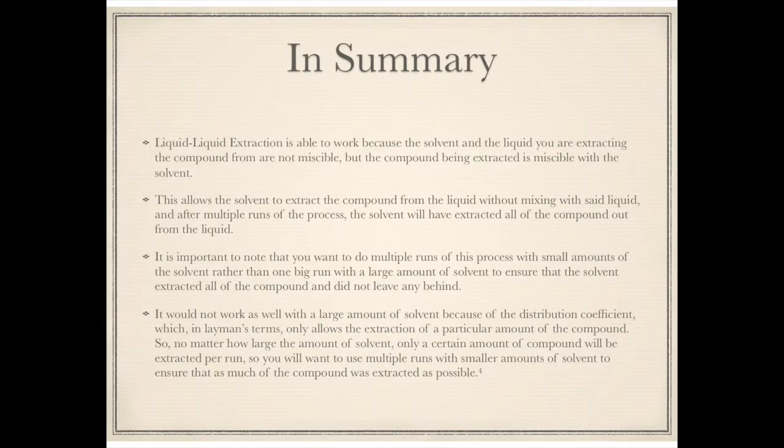It is important to note that you want to do multiple runs of this process with small amounts of the solvent rather than one big run with a large amount of solvent, to ensure that the solvent extracted all of the compound and did not leave any behind. It would not work as well with a large amount of solvent because of the distribution coefficient, which, in layman's terms, only allows the extraction of a particular amount of the compound. So, no matter how large the amount of solvent, only a certain amount of compound will be extracted per run. So you will want to use multiple runs with smaller amounts of solvent to ensure that as much of the compound was extracted as possible.